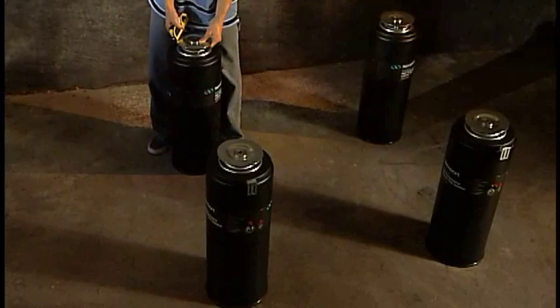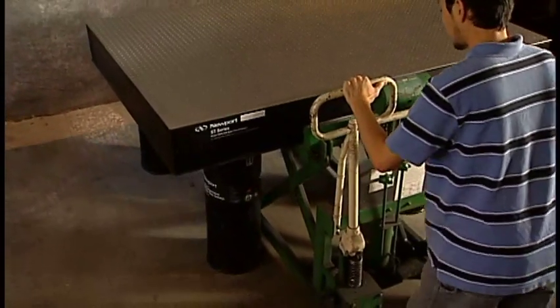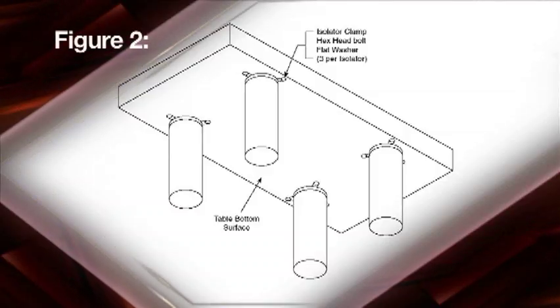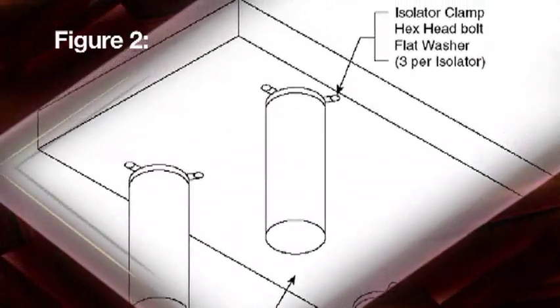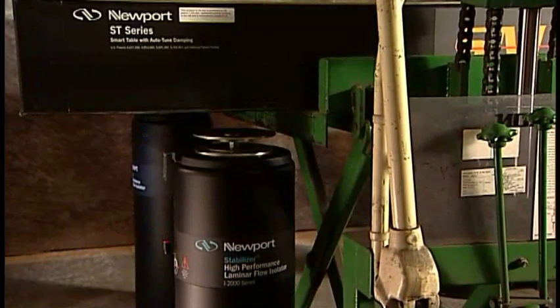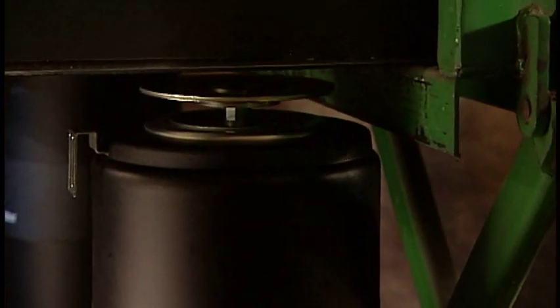Once satisfied with positioning, use a forklift or pallet jack to position the table over the four isolators. The bottom of the table contains bolt hole patterns for mounting the isolators to the table via the safe lock clips. Position the table so the bolt hole patterns line up over each isolator. Slowly lower the table to within one-half inch of the isolators. Slide adjustment of isolator positioning may be necessary to achieve proper alignment. Move the isolators if necessary, then lower the table onto the isolators and remove the forklift or pallet jack.